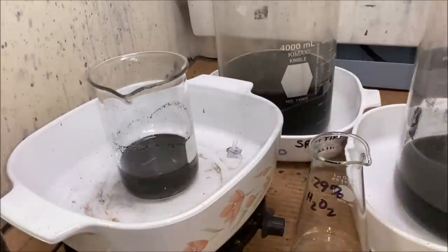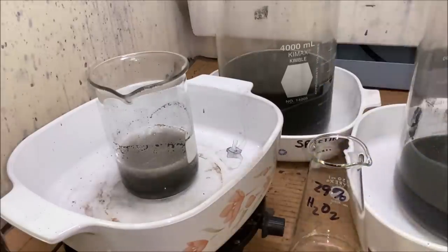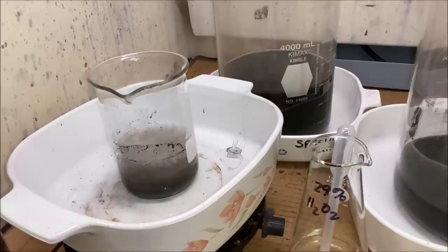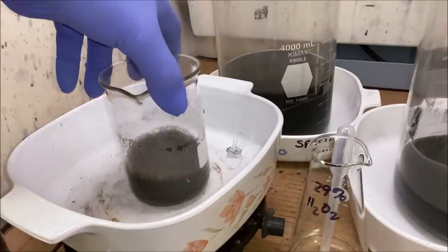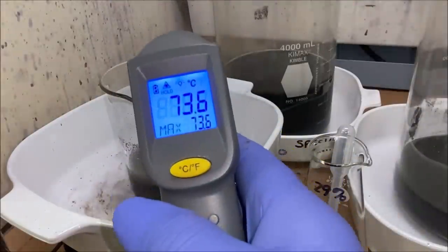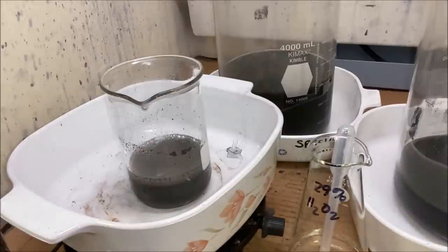Got a little bottle of 29% hydrogen peroxide here. Just gonna keep adding it until we see some kind of noticeable difference in here. I didn't have to add any heat, just enough heat from the reaction. We got 73 Celsius, 164 Fahrenheit, just from the two reagents reacting with each other.